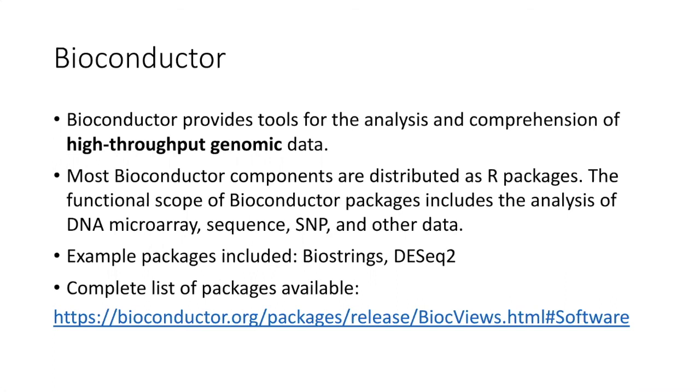There are some pretty famous packages you probably already know, like Biostrings for handling sequence data, reading FASTA, FASTQ, and manipulating it, or DESeq2. This is probably more well known. It's for differential expression RNA-seq data analysis, and you can use this link to check out what kind of packages are available. This is very useful because all the packages are categorized in different sections: for RNA-seq analyses, for microarray analyses, for comparative genomics. So you can target your package easily under this link for specific questions.